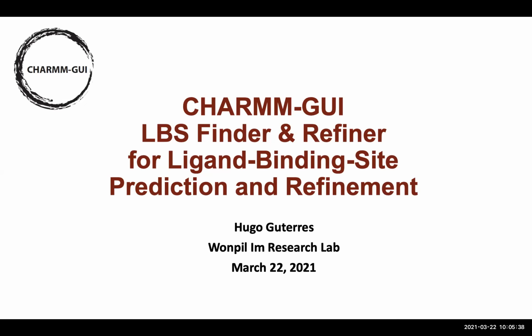I'm a postdoc. Today, I will talk about our new module, CHARMM-GUI LBS Finder and Refiner, that is used for ligand binding site prediction and structure refinement.